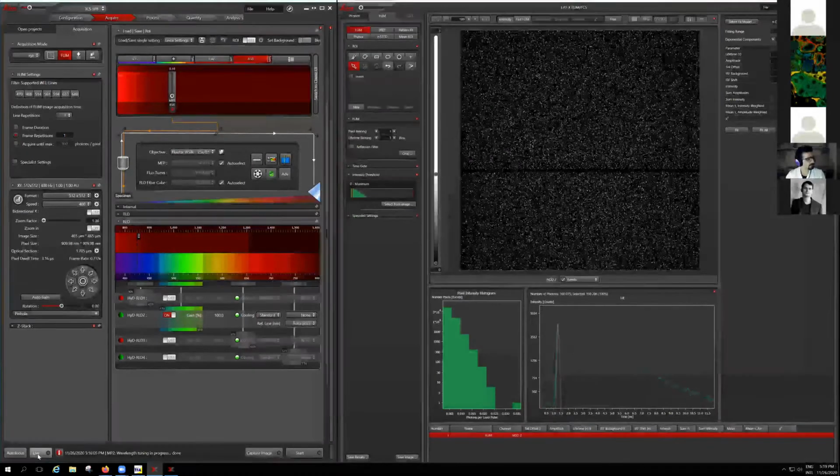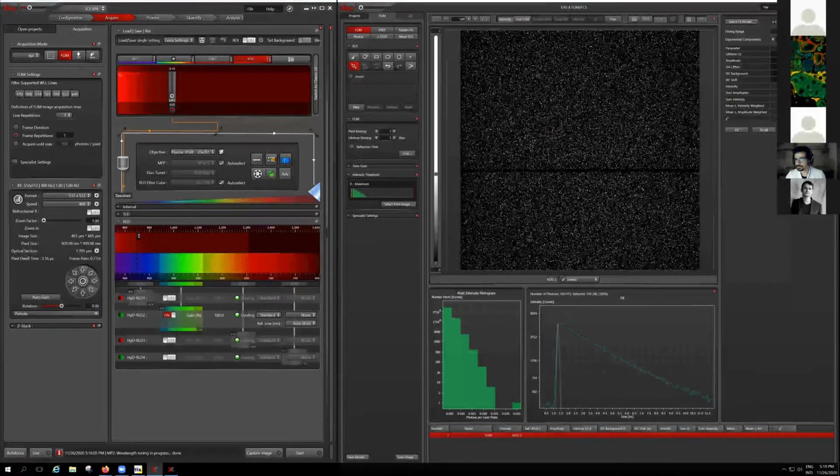There has been a question in the chat. I think that's Louise asking, what is an acceptable range of photon counting? I guess you've answered this question already. If there's still part of the question, maybe you can answer.